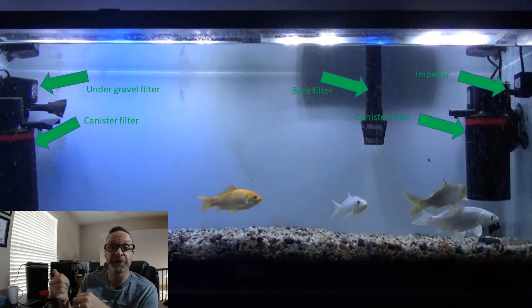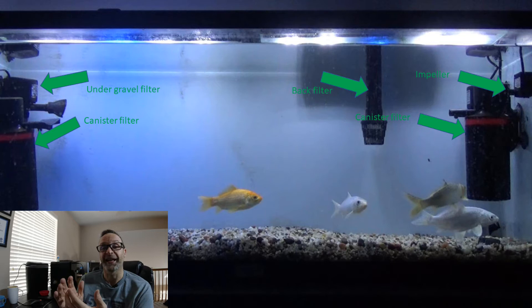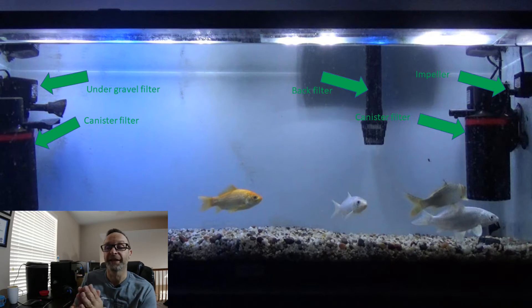We also have the standard back filter, as you see with any aquarium, which also has carbon in it. And then most importantly — and this is kind of new — we actually have an under-gravel filter. Under-gravel filters are super important because amino acid solutions are denser than water. They will settle into the gravel and unless cleaned thoroughly, they'll come out in subsequent experiments and really mess things up. So the incorporation of an under-gravel filter is super important. We let that run for a week just to make sure everything's out of the gravel.